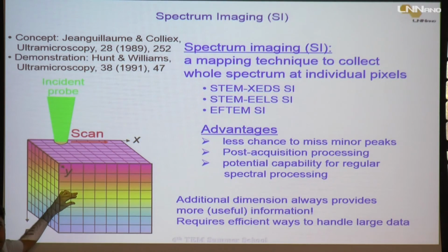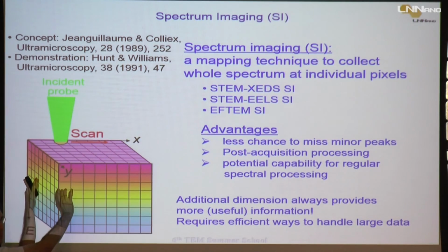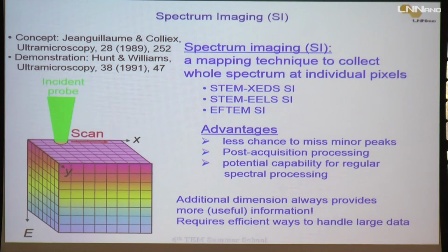With the peaks. The EDX peaks. Okay, if you put your spectrum here, I want to get this peak. You just go to this specific energy and acquire this layer. And then you have the distribution of photons in space related with that specific energy, okay?